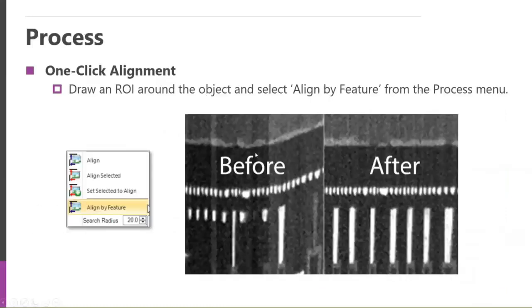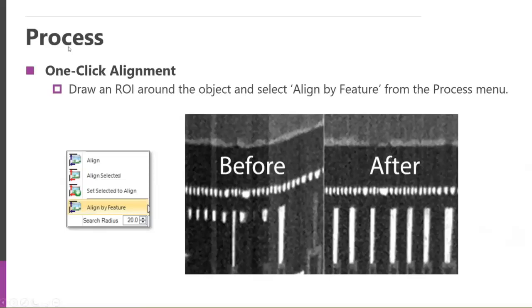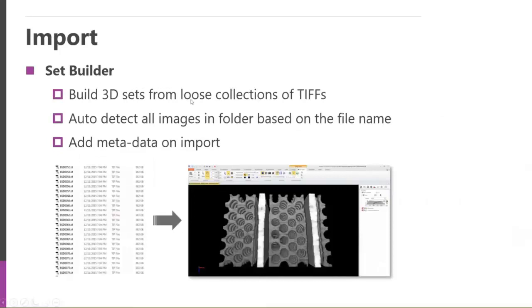If you've got a data set that has some issues, maybe during the Z-Stack there's been some misalignment, things like that. We have a really powerful tool under the process tab, and it's called Align. And there's a really nice one that allows you to choose a small region of interest and say align by feature, and very quickly your data set can be aligned very nicely. And it's a very nice tool.